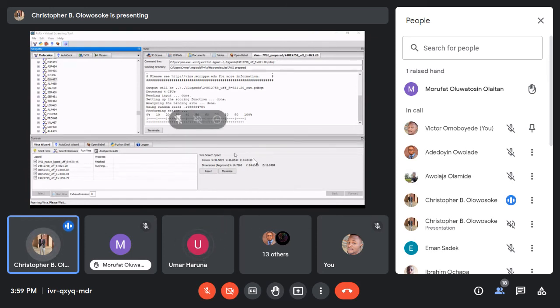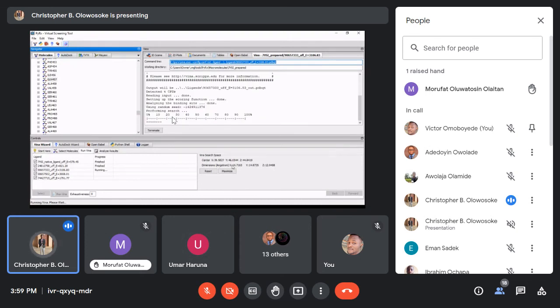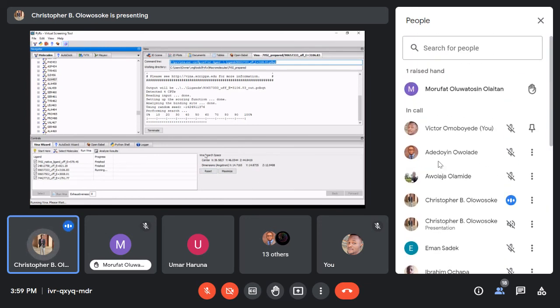Whenever you are conducting your docking, you can write out the center information and dimension information, so that other people who might want to use the protein or macromolecule in their analysis will find it easier to use these coordinates for their docking interaction.